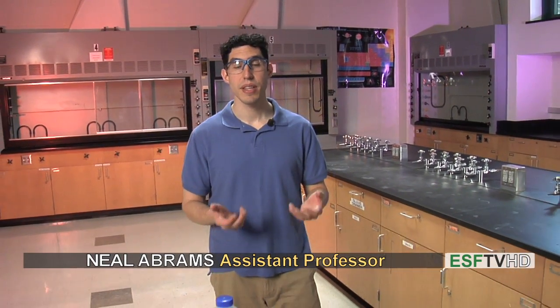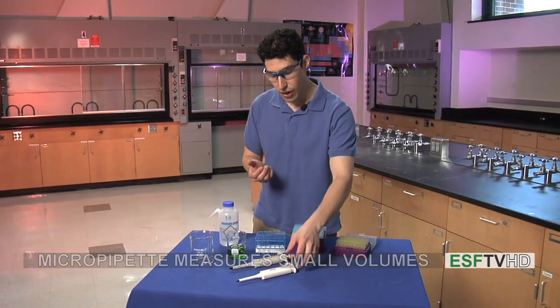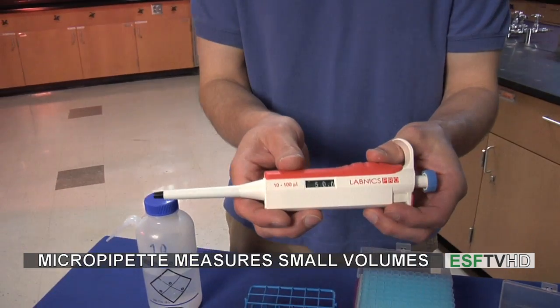Hi, and welcome back to the lab. In this segment, we're going to talk about using the micropipette. The micropipette is a device for measuring volume in very small volumes, much smaller than we would measure in a graduated cylinder, a volumetric flask, a beaker, or anything along those lines.